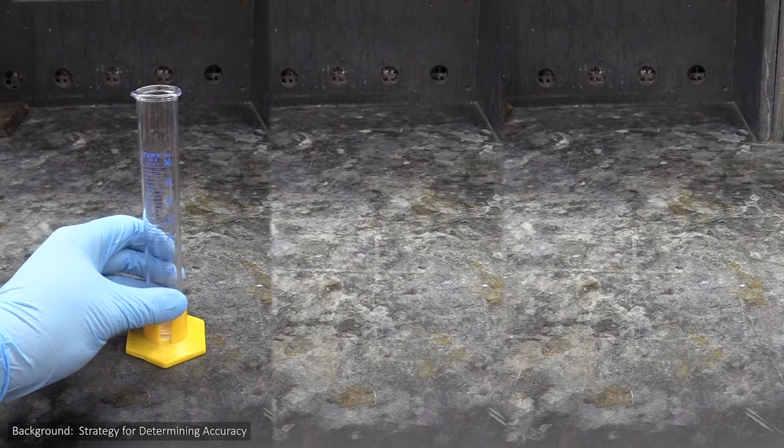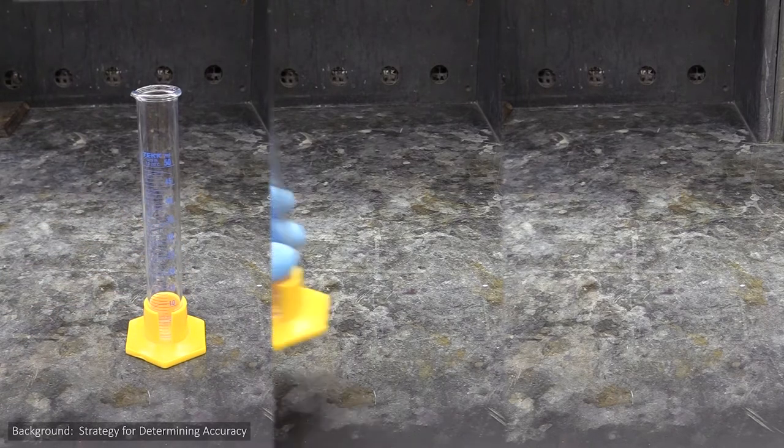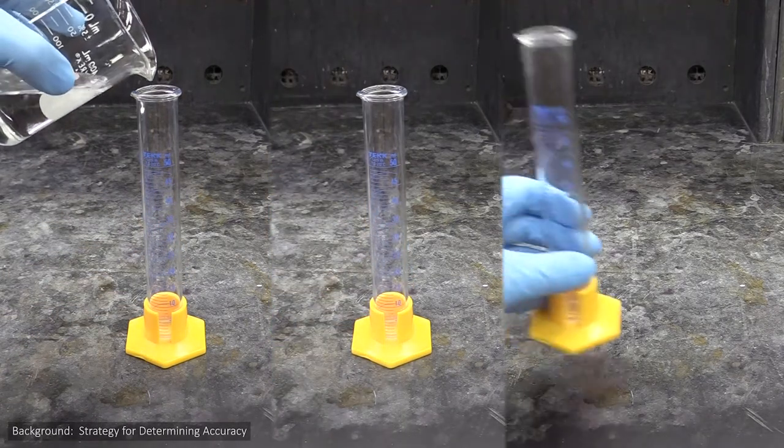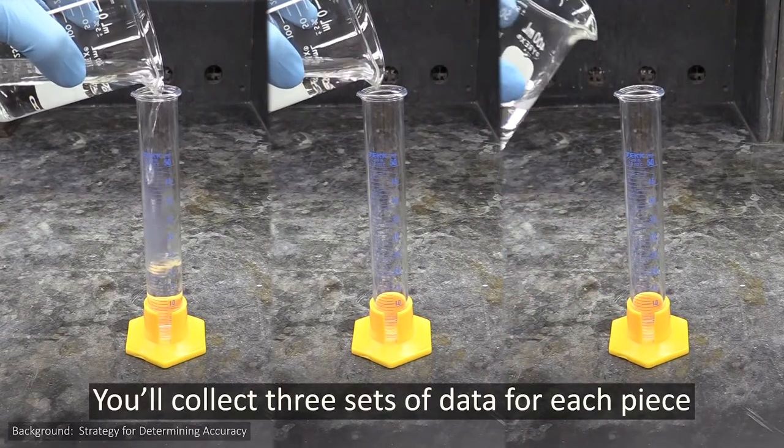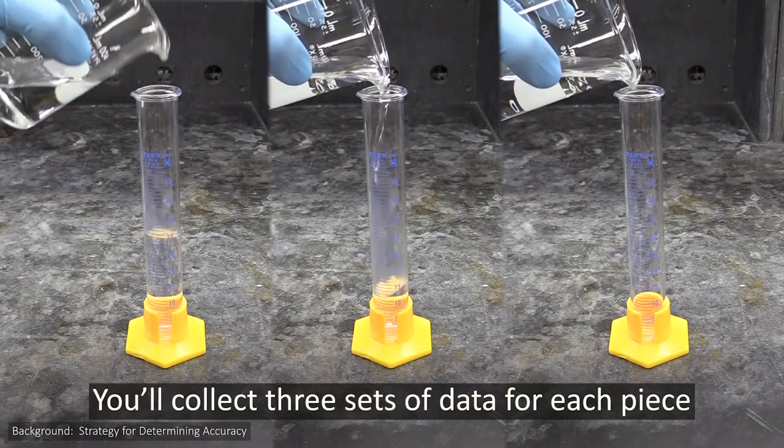Of course, no real science experiment relies on just one data point, so you will take not one, but three sets of read and actual measurements with each piece, and compare the average read measurement to the average actual measurement.